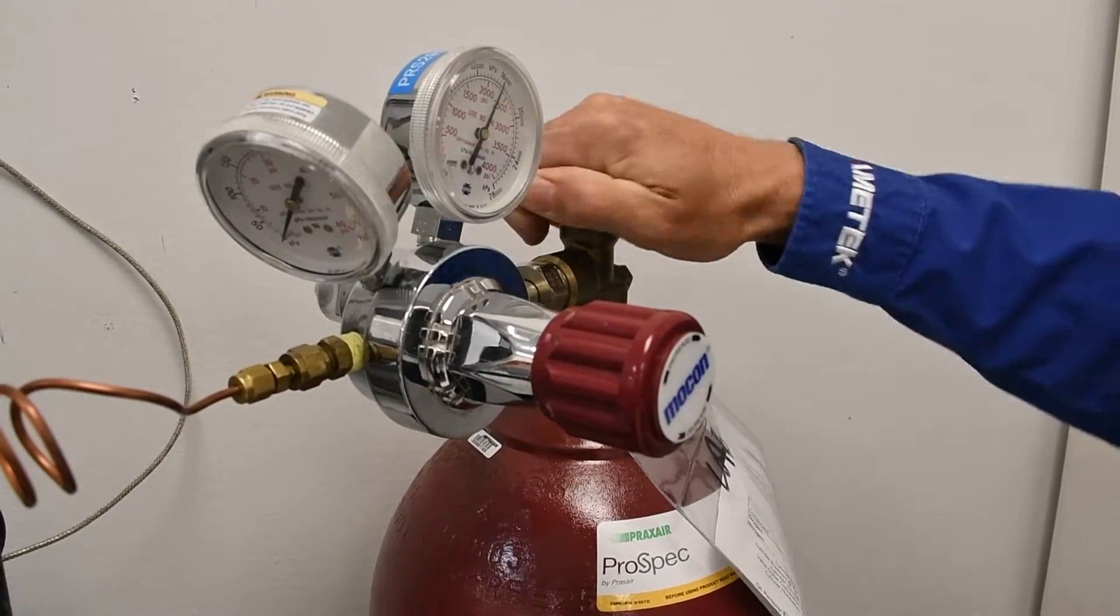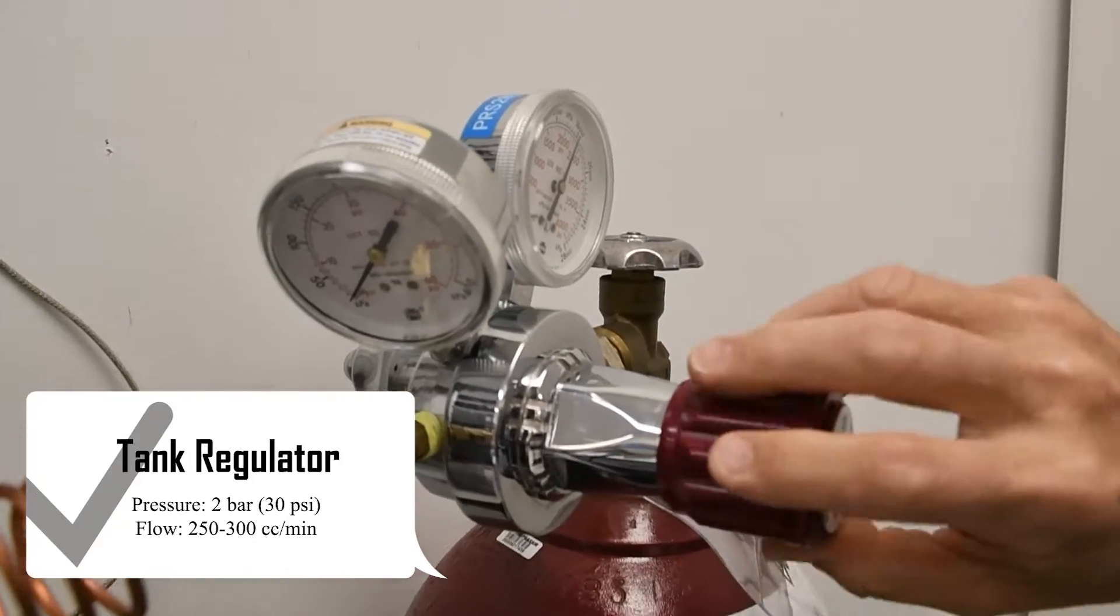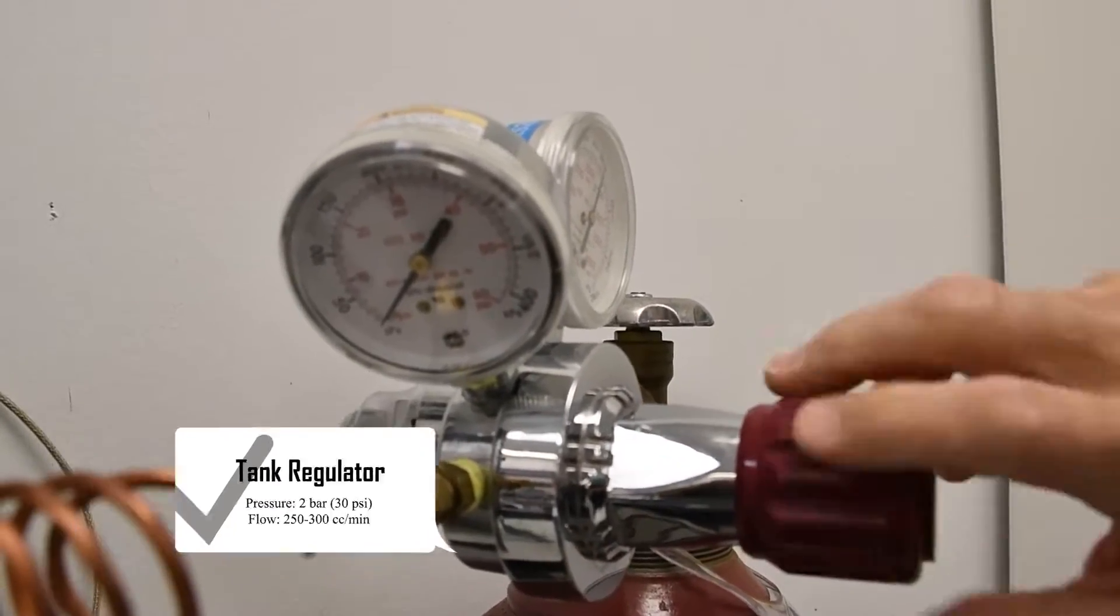Open the main tank valve and adjust the tank regulator to the following pressure, two bar or 30 psi. The flow 250 to 300 cc's a minute.